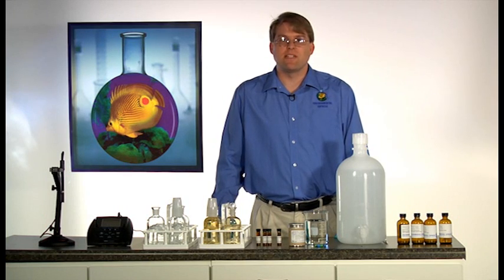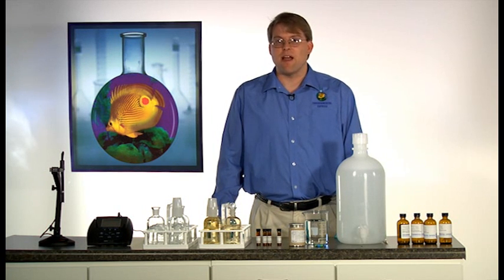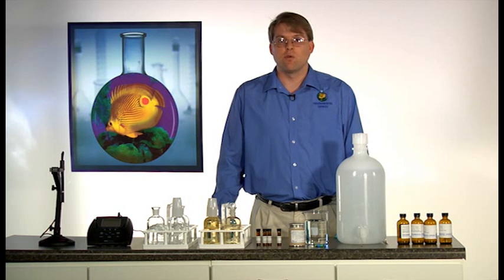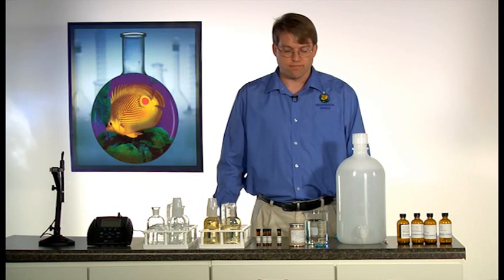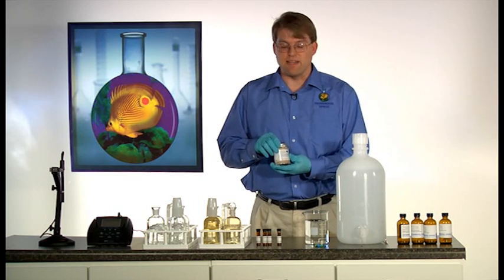Obtaining an acceptable seed source presents a unique problem for many analysts. Influents are often toxic and are highly variable, while effluents have been chlorinated to remove microbial populations. To overcome these problems, use a freeze-dried seed such as poly seed.